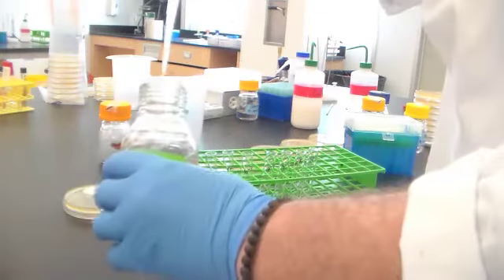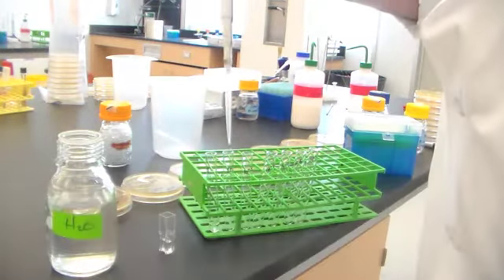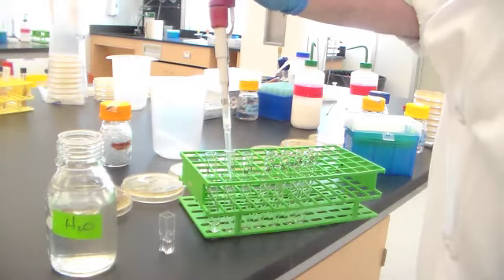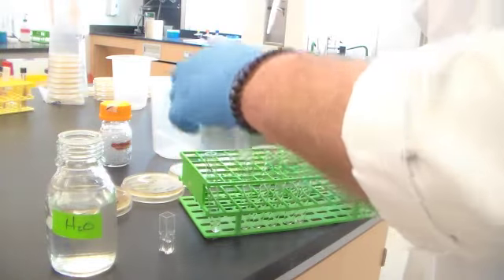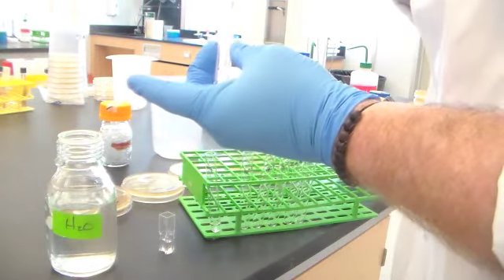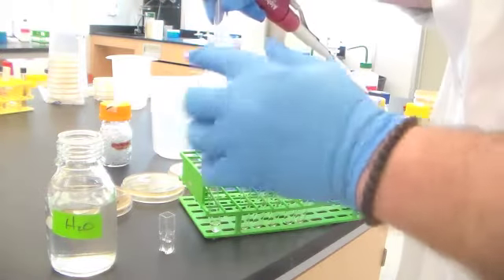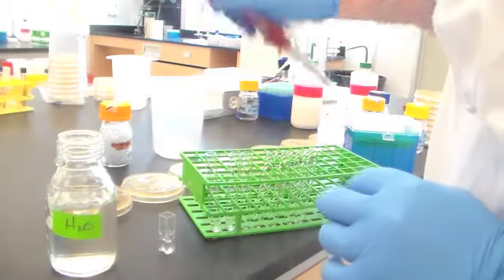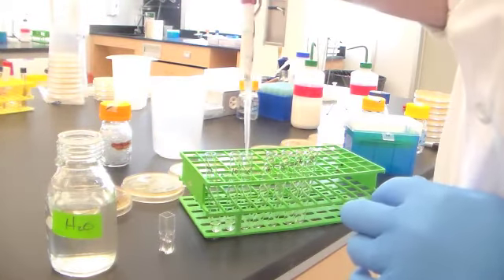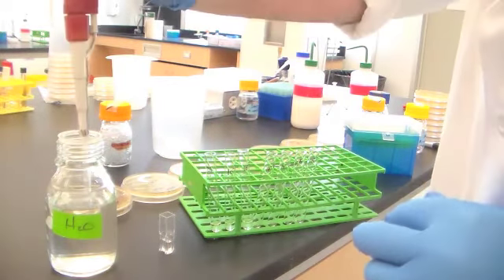As I do that, there's a tendency for you to want to just stick the pipette tip in here and shoot that water out. Instead, what you want to do is put the pipette tip as close to the bottom as possible and expel it, because you don't want water splashed up in spots on the side, because it's important that there's precisely 900 microliters in the bottom of each one of these tubes.